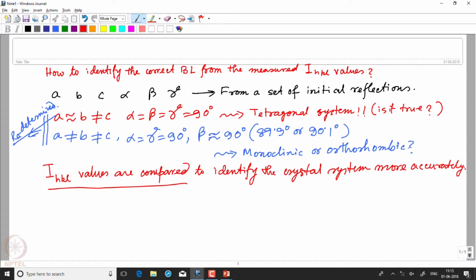So at this point, after the data reduction is done, re-indexing of the unit cell is done, and then one looks at the statistics of all the HKLs and tries to see what kind of information can be found from those reflections.